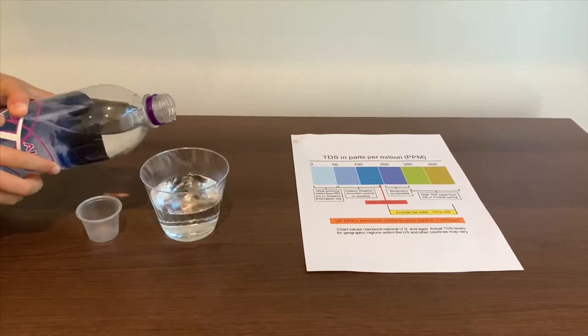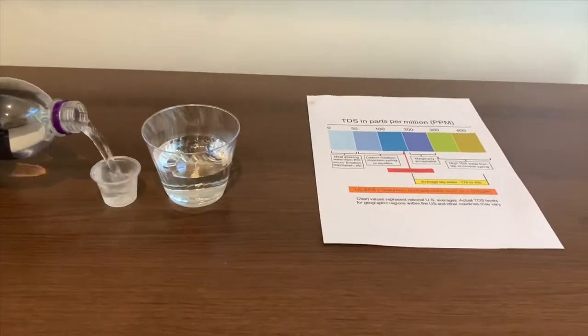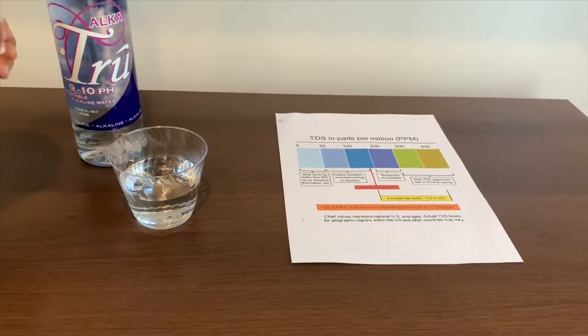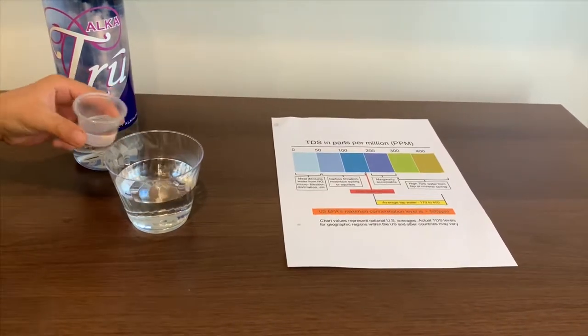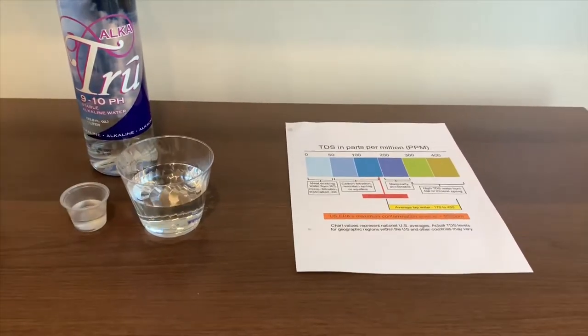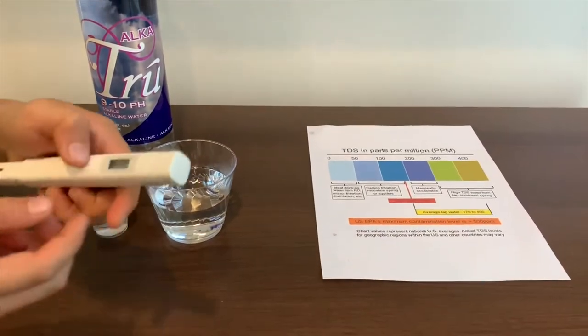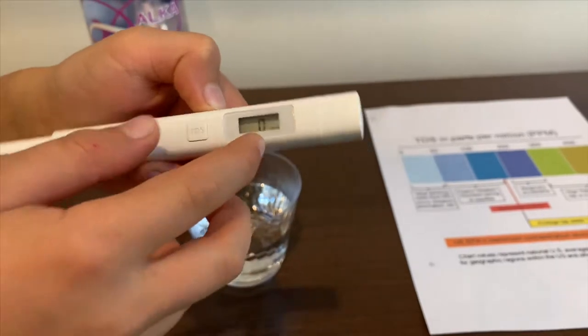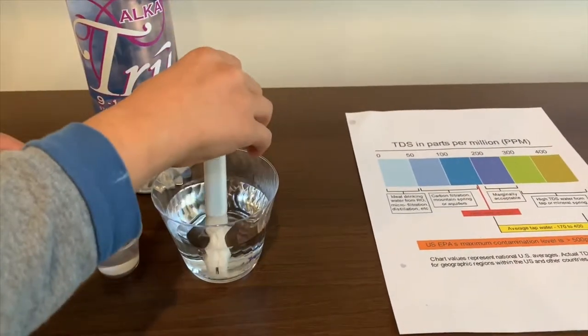Let's pour some water in. Turn on the TDS tester. Make sure it says 0 and put it in.